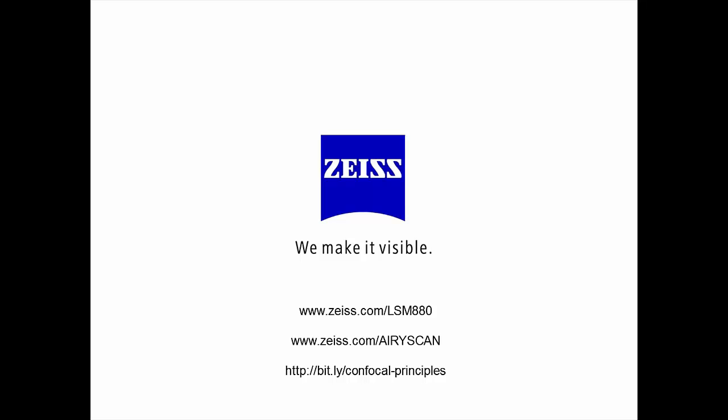The second one is, is Airyscan a proprietary Zeiss technology? Yes, it is. The idea of using light which fell on the pinhole and light that was within the pinhole has been something of a dream for years and years. I'll be honest, even in companies I worked with before Bio-Rad, going back to the year dot, people have tried to do this.